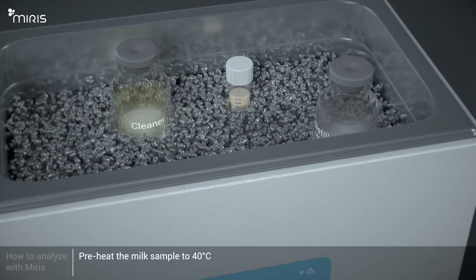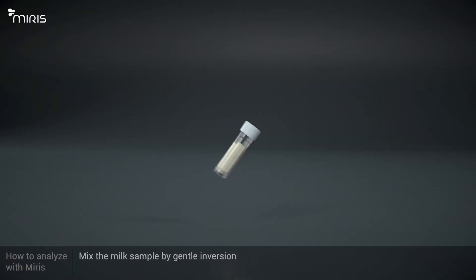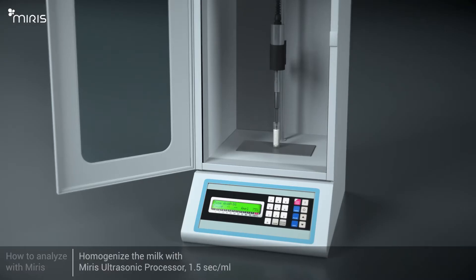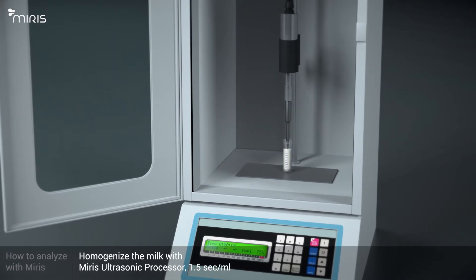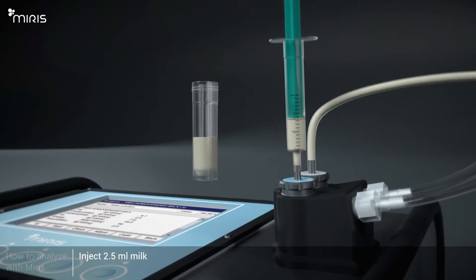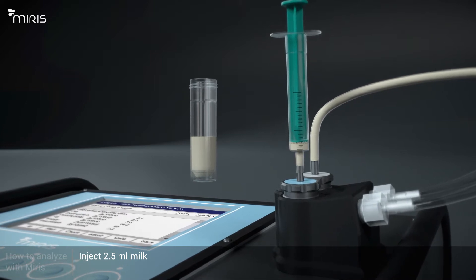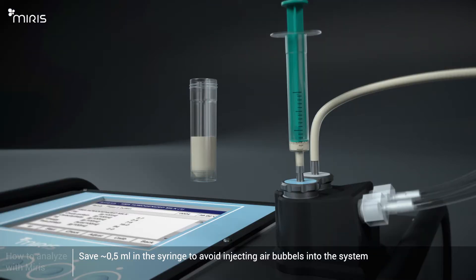Preheat the milk sample to 40 degrees Celsius before proceeding with the analysis. Mix the milk sample by gentle inversion. Homogenise the milk with the Meris Ultrasonic Processor, 1.5 seconds per millilitre. Inject 2.5 millilitres of the milk sample. Avoid injecting bubbles and leave about 0.5 millilitres in the syringe. Leave the syringe on the inlet during the analysis procedure.